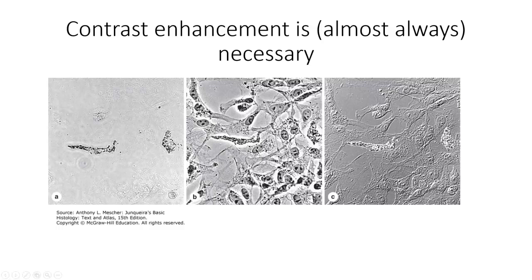So panel B over here is an example of a phase contrast micrograph. Okay, so in phase contrast, what we're going to do, without getting too technical, is play with the light such that very small changes in density, so even very fine structures, are going to be rendered out as big differences in optical contrast.